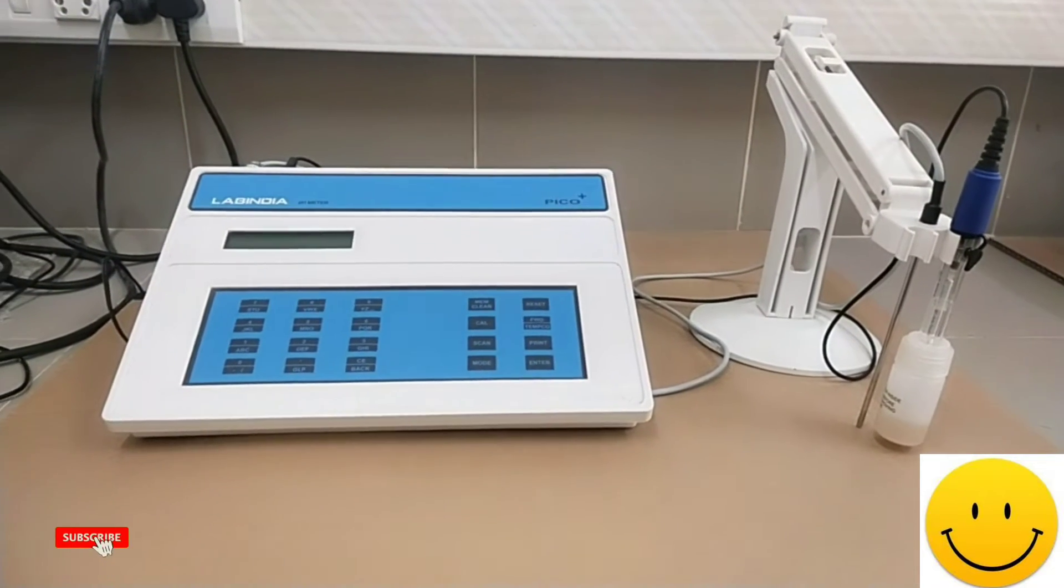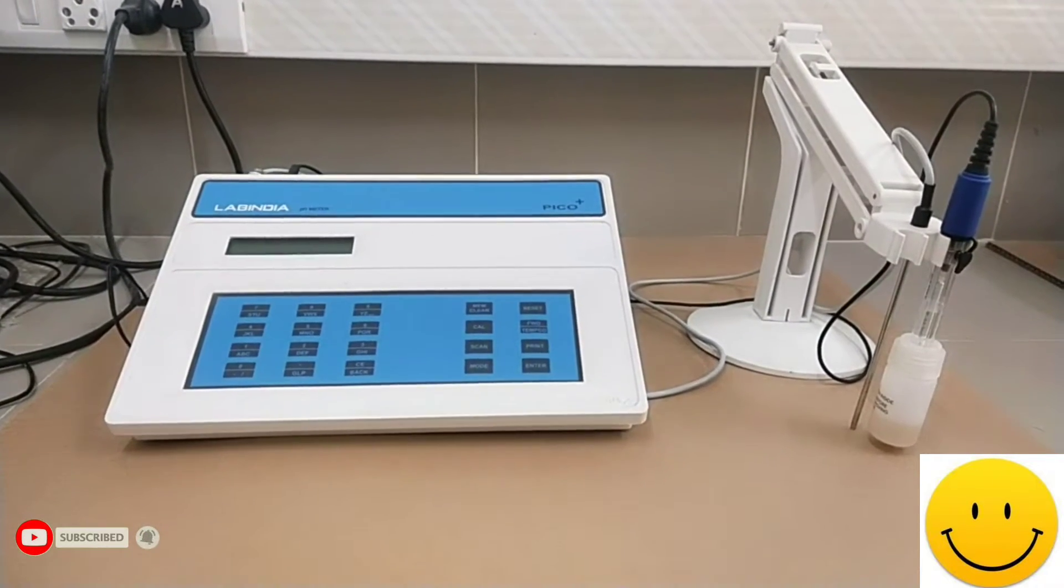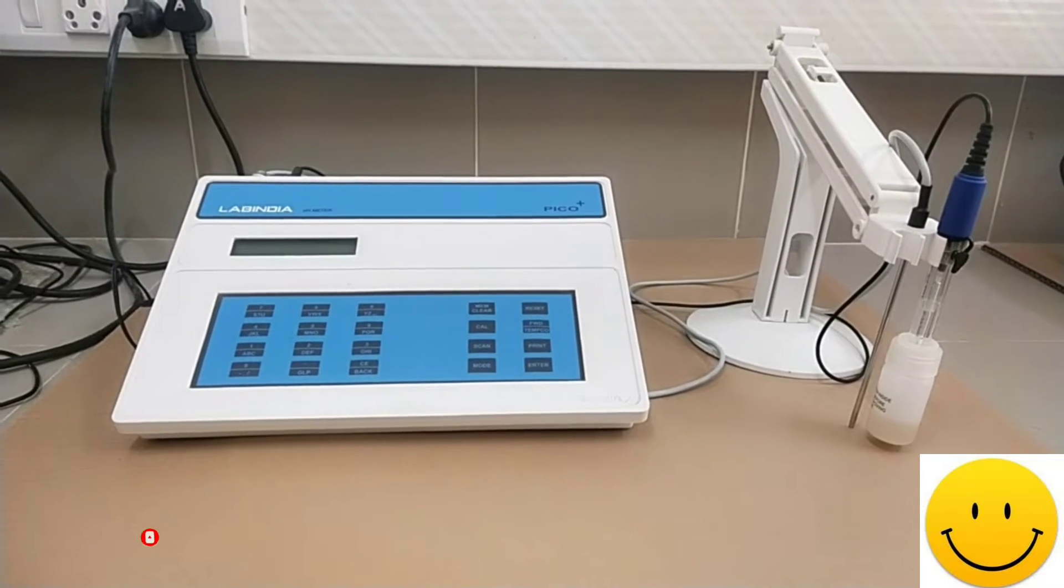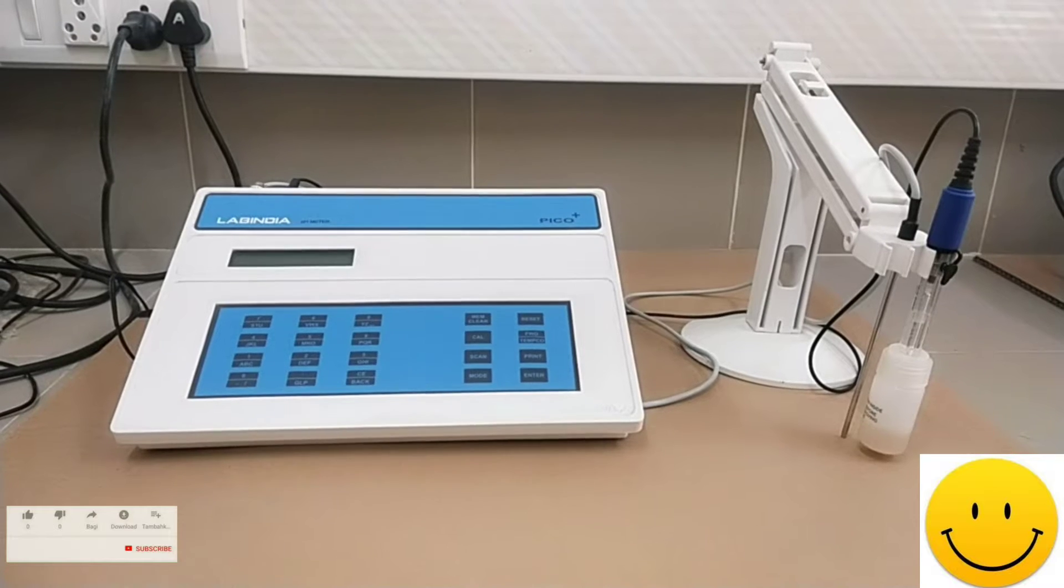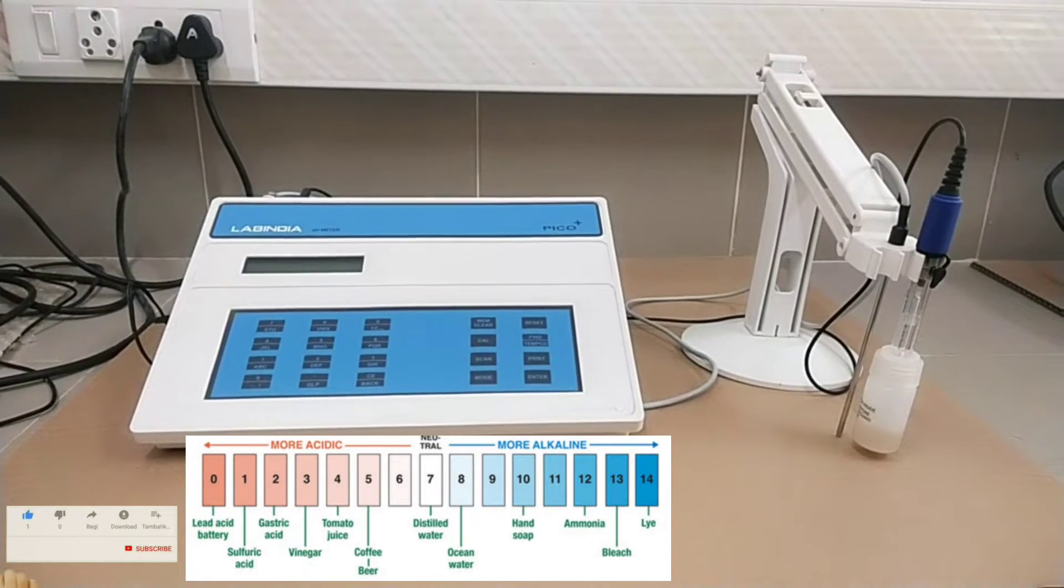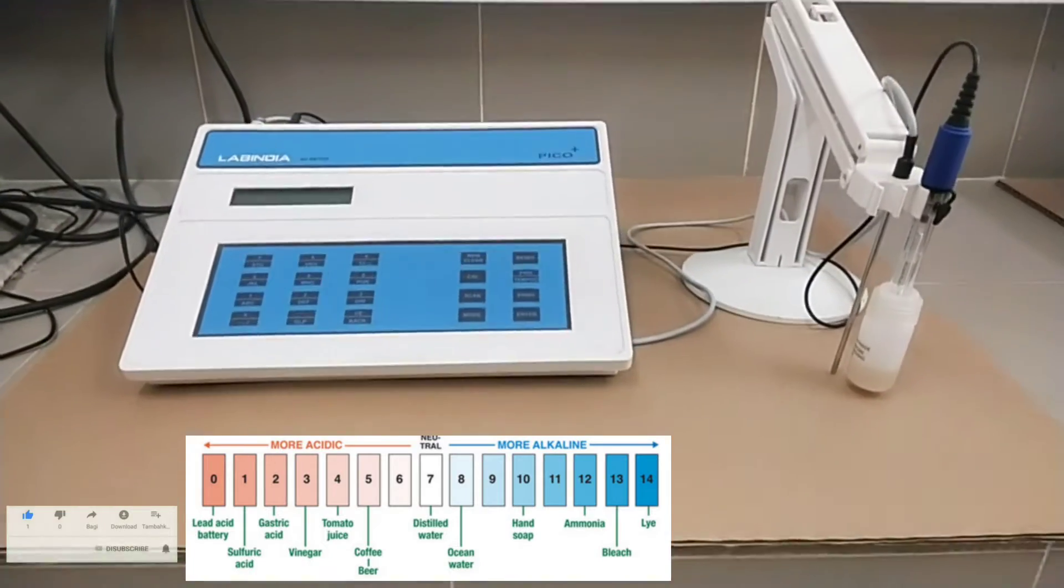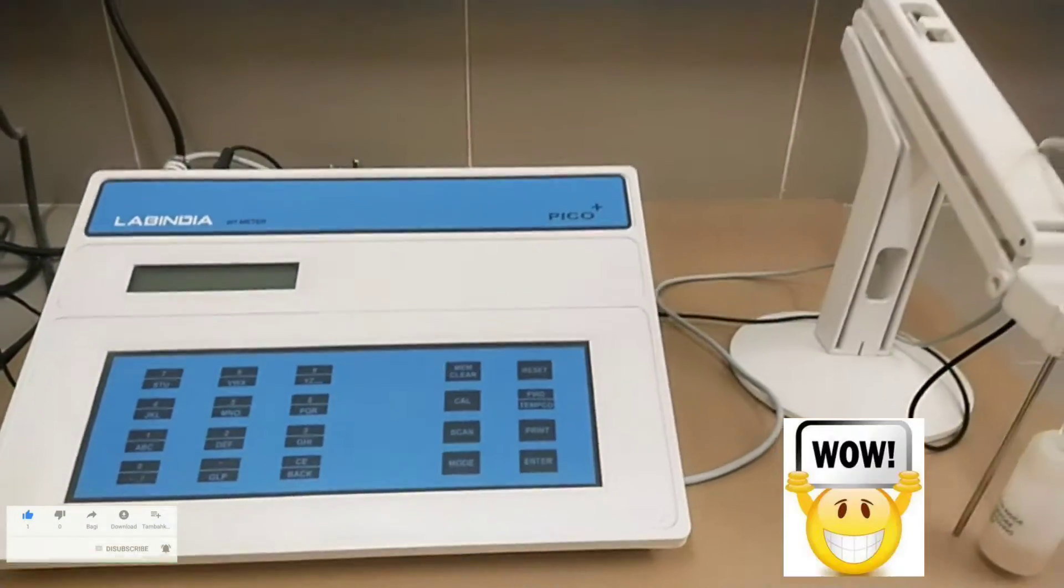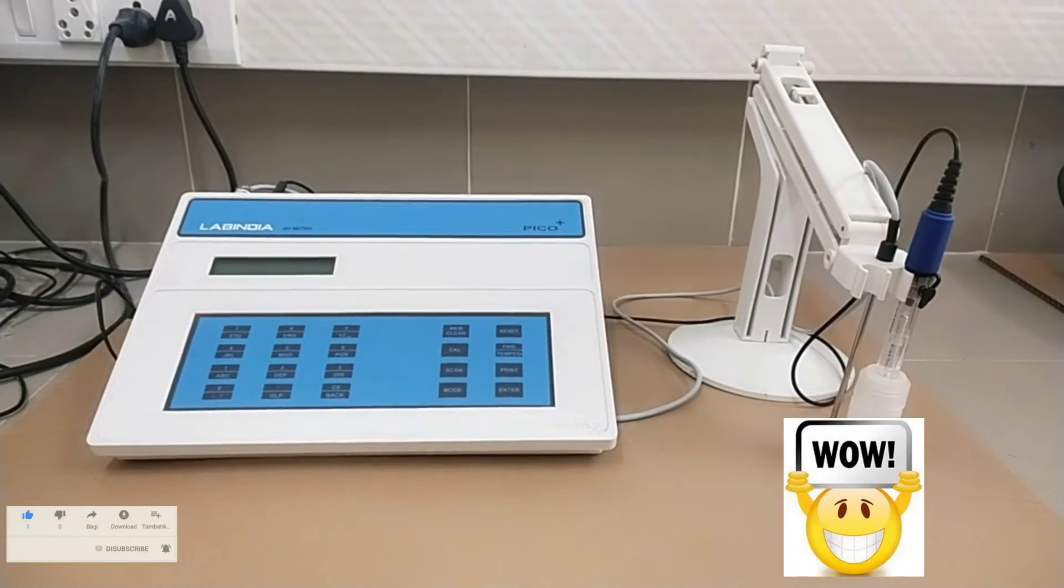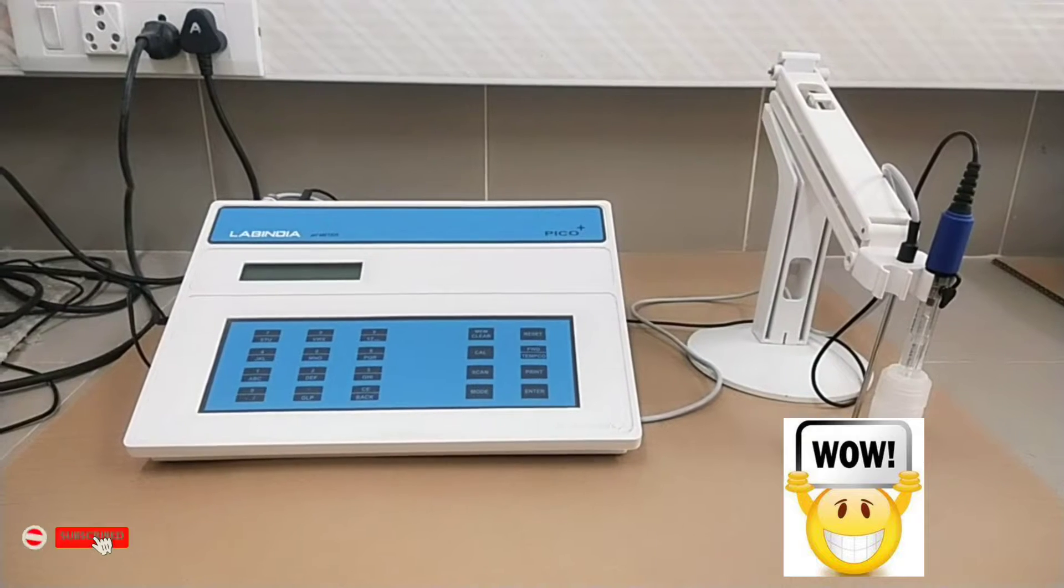This bench top pH meter measures simultaneously pH, mV and temperature in pH mode. Mathematically, pH is defined as the negative logarithm of the hydrogen ion concentration. Generally pH is measured in the scale of 0 to 14 pH units, but with the development in technology pH measurement range is extended from minus 2.00 pH to 20.00 pH.